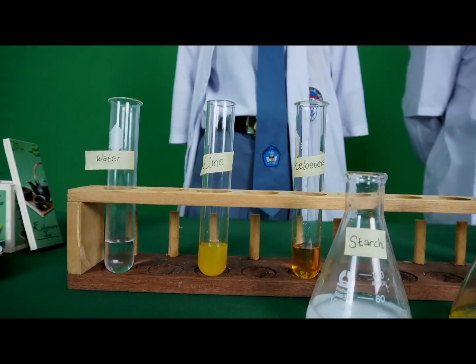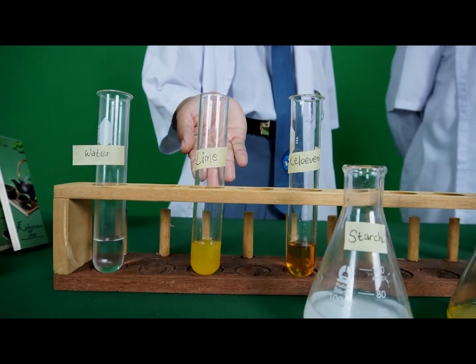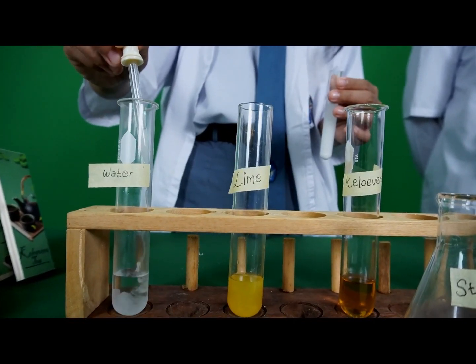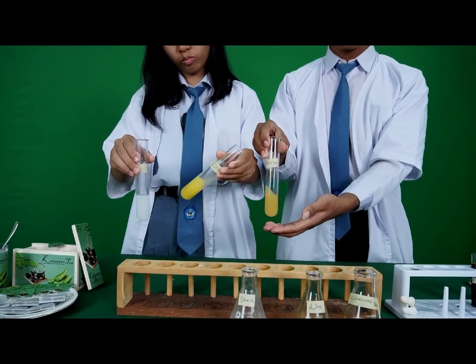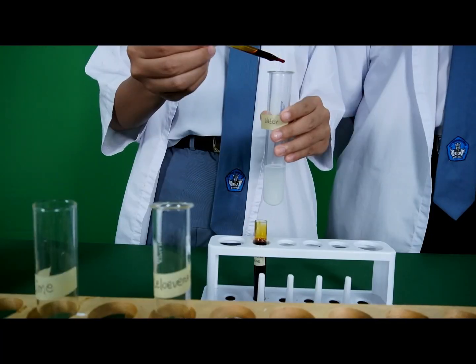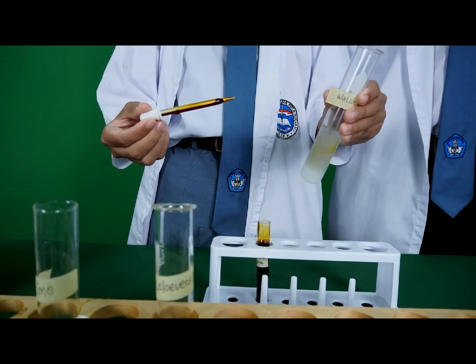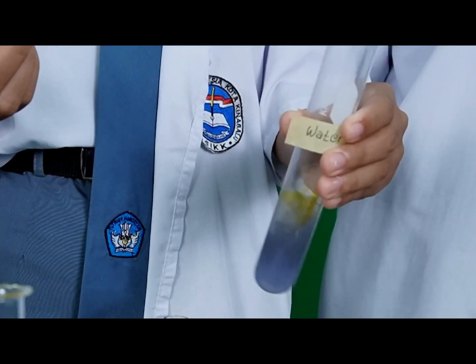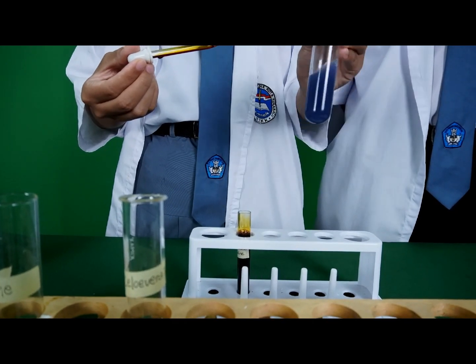First, prepare 3 test tubes: tube 1 water, tube 2 lime, tube 3 Keloevera tea. Fill each test tube with 5 ml of starch solution and stir well. Drop the iodine into the test tube while stirring. Record the number of drops needed to turn the sample blue-black. The more drops of iodine needed to change the color to blue-black, the more vitamin C content.